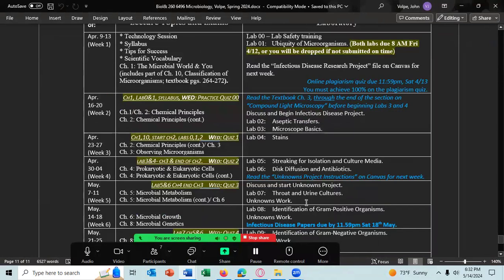So today is May 14th, and we are supposed to be covering Lab 8, identification of gram-positive organisms.